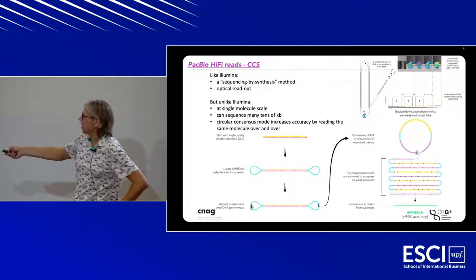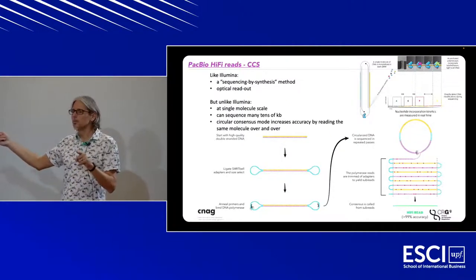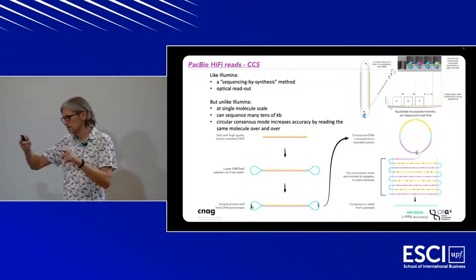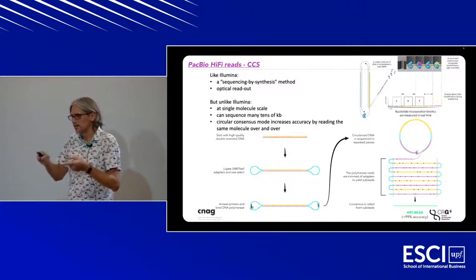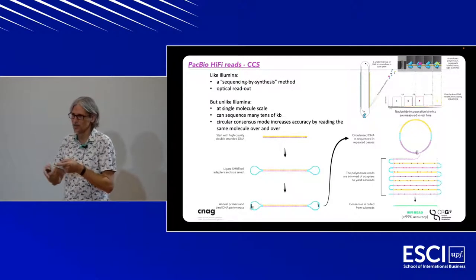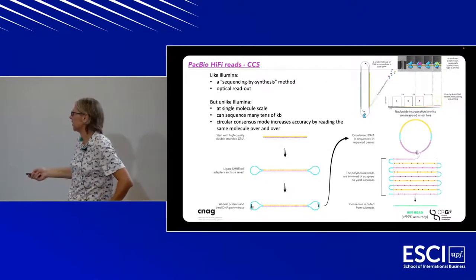But it's single molecule scale, and you can generate really long sequences, okay? As long as the DNA fragment is, with the limitation of the fact that the laser light that's used to excite the fluorophore can kill the enzyme over time. So there is a limit. There is a limit to the read length.